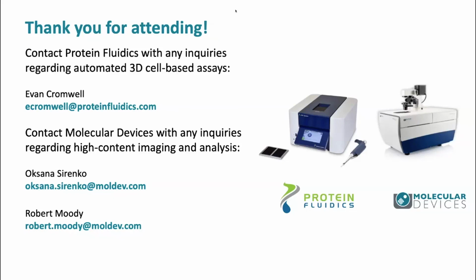So you put multiple organoids in there. If you think about the number of data points you have, if you have one well with 4 or 5 organoids in there that you're processing, each organoid is an independent data point, so you can collect multiple data points on each one, with 32 sample wells in each plate.